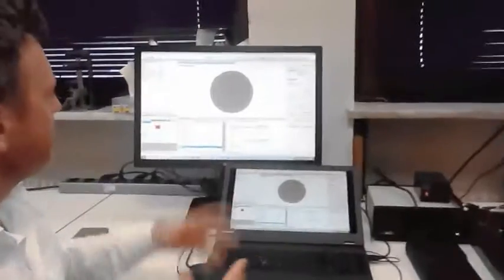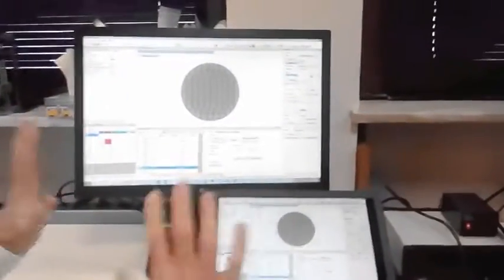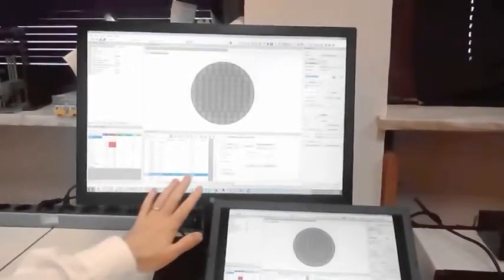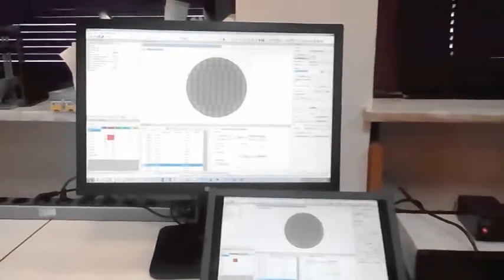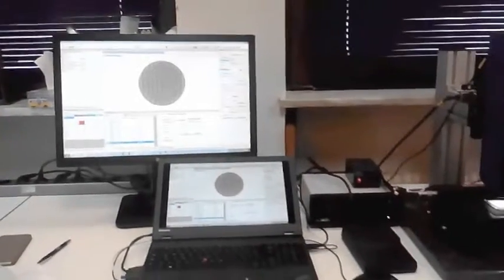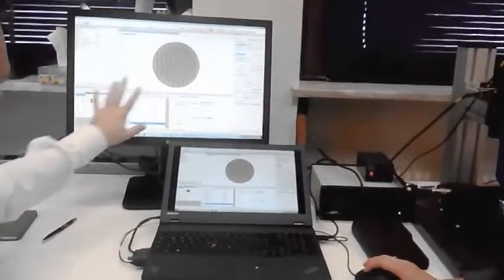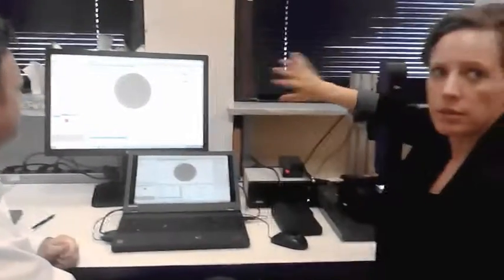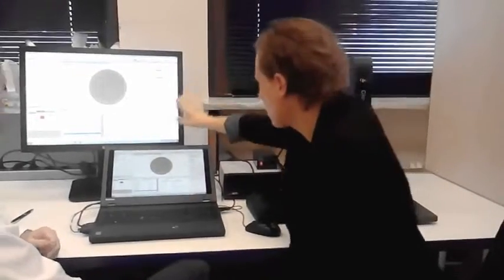So we move into this new phase, this new layout, which now gives us all of these different layouts, and I'm going to have to pass back over to Karen to give us a summary of the windows of these different results, of what we've got. So on the right side here, you can see our control window. It stays in the same position.